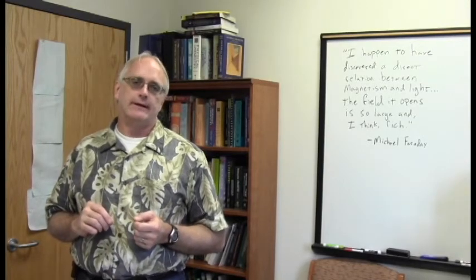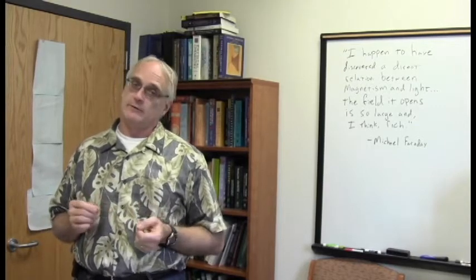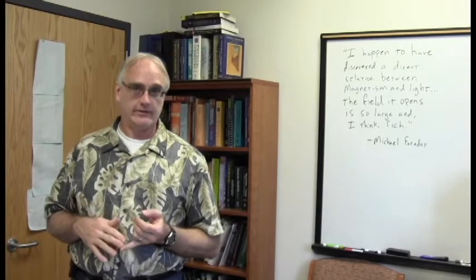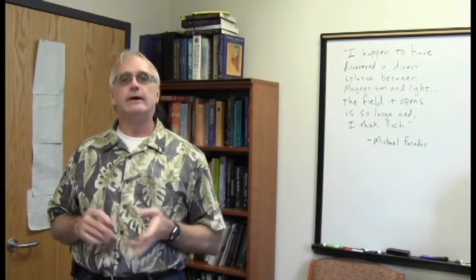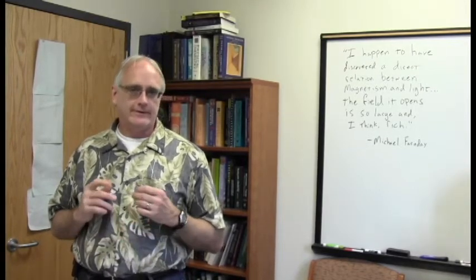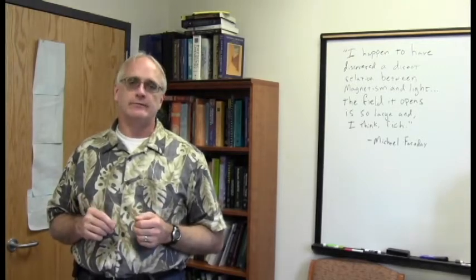Unfortunately, we weren't able to get any carbon spectra out of this sample. The concentration was just too low. And remember, when you do carbon, you're essentially switching from proton, a 100% abundant nucleus, to C13, a 1% abundant nucleus. In effect, you're cutting your concentration by a factor of 100. We just did not have enough in there in chloroform to get a decent spectrum.